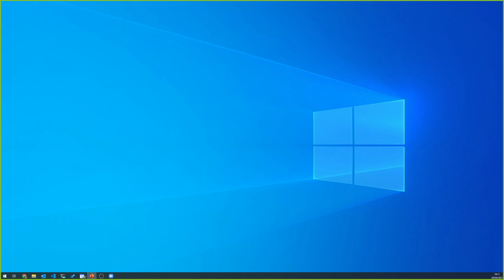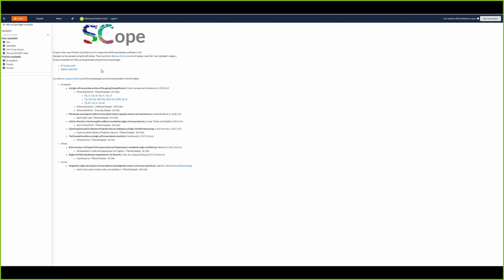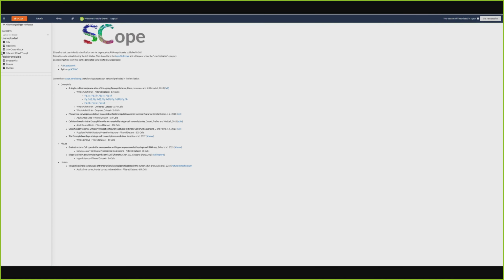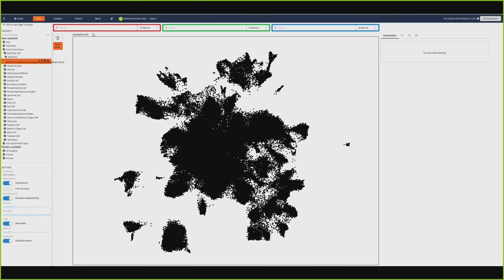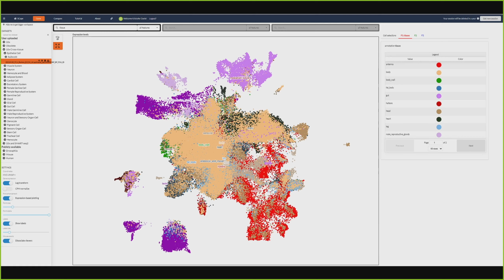For the very last demo I have, I'm just going to very quickly show, this is a different session now. This is the cross tissue analyses that Hongjie mentioned. You're able to also find them. They'll be in the final data set available on Scope. And so this time we're looking at the epithelial cells. I can search for tissue, and I said these are cross tissue. So now you can see which tissue each of these cells came from.